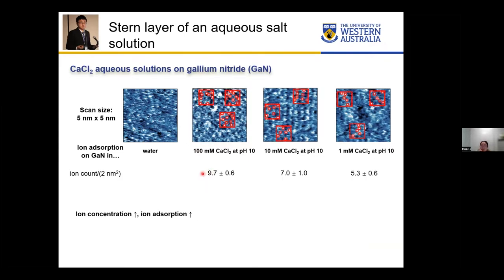From these stern layer images, we picked two-nanometer by two-nanometer square areas in each image and counted the ions. From the identified ions, we can clearly see that on a microscopic level, higher ion concentration causes more ion adsorption, because there is definitely a higher ion density at higher concentrations.